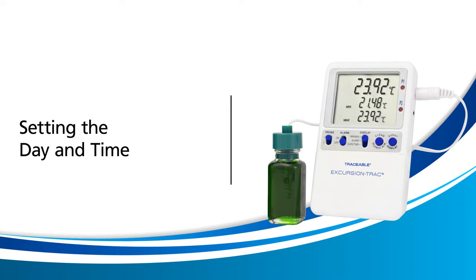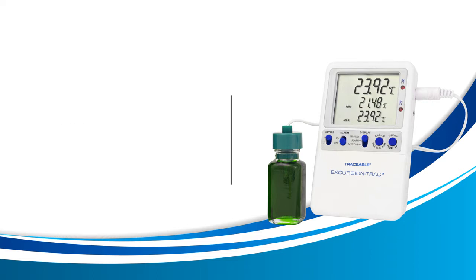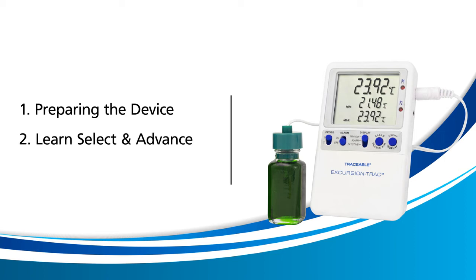To ensure we provide the best learning experience, this video will be divided into 3 small lessons. We'll start with preparing your device to set the day and time. Next, we'll learn about the Select and Advance button. And then we'll use the Select and Advance buttons to set the day and time. Additionally, we also recommend that you have your device with you so you can follow along. With that in mind, let's get started on setting the day and time.